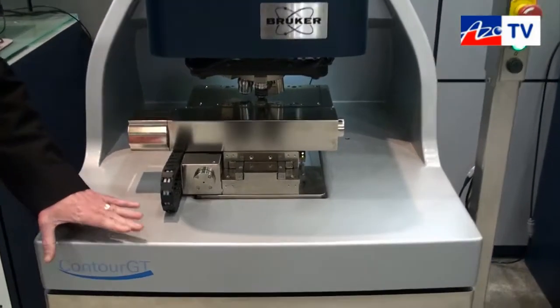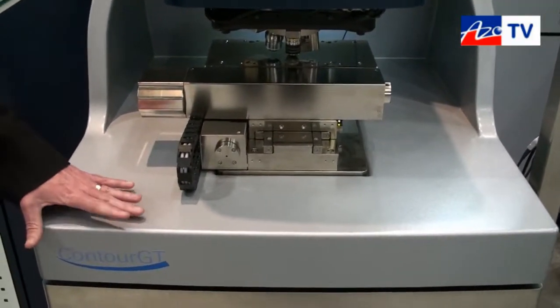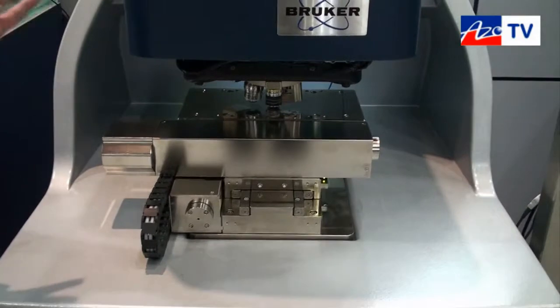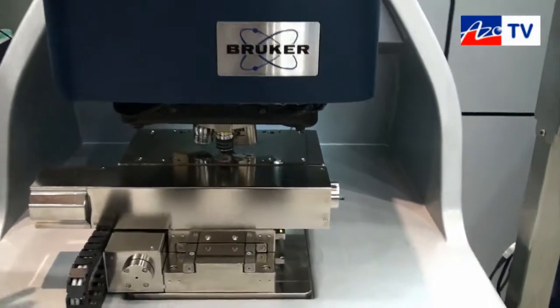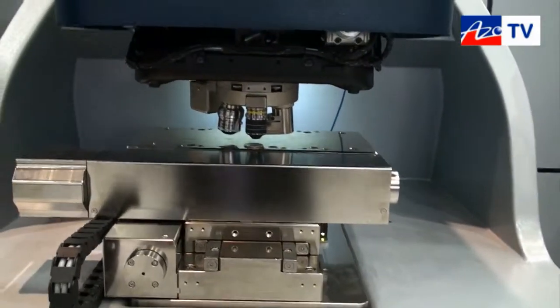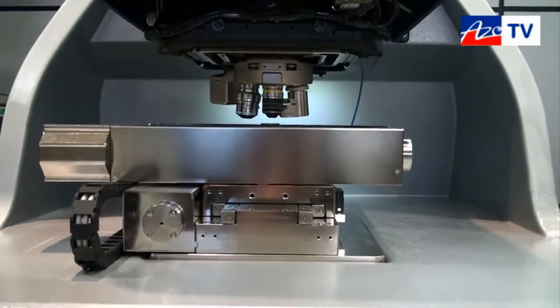The Contour GT includes a family of instruments. The X8 is really the top of the line of this family. We also make benchtop units which are smaller but contain all of the optical elements.